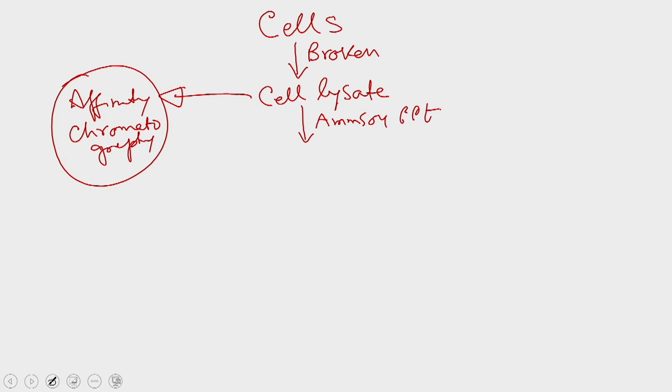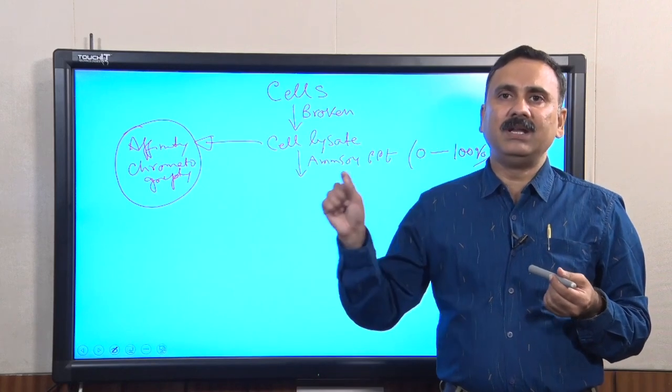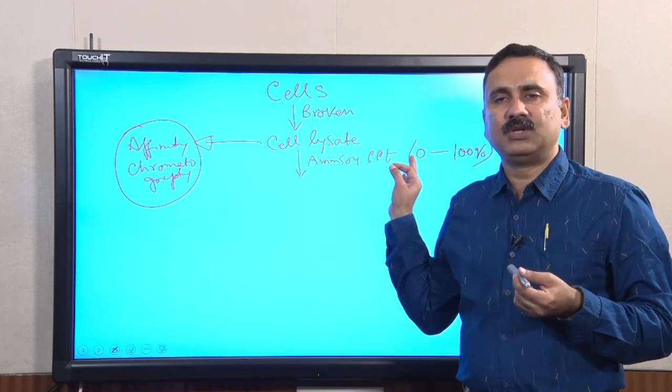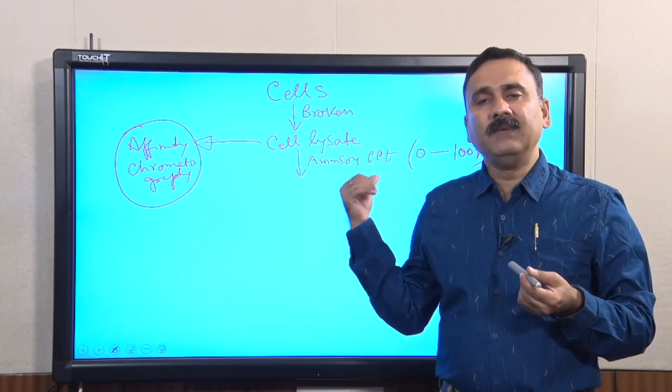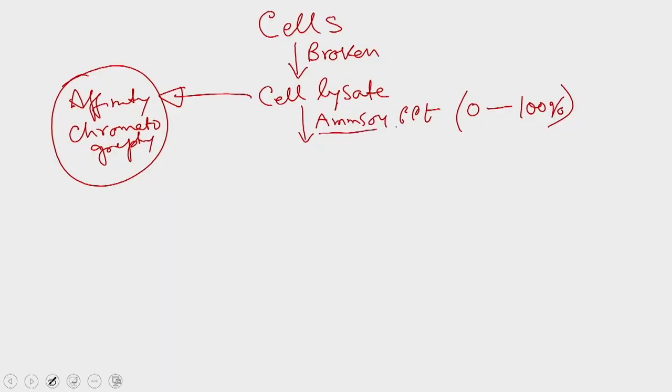So I'll use different concentrations of ammonium sulfate, which means from 0 to 100%. And if you do not recall, you can go through Google or some other sources, and that will tell you what amount of ammonium sulfate you have to add into a cell lysate to get 30% saturation. The 100% saturation is the maximum you are going to get. Theoretically, you may not get 100% saturation in many of the cases. But the first step you can do is ammonium sulfate precipitation, and that is going to give you different fractions.